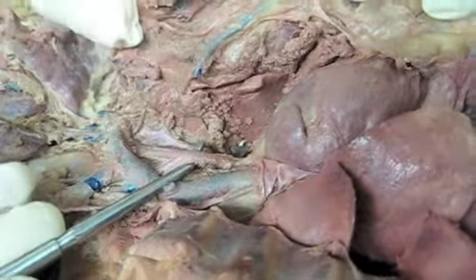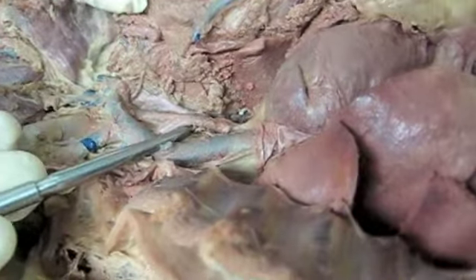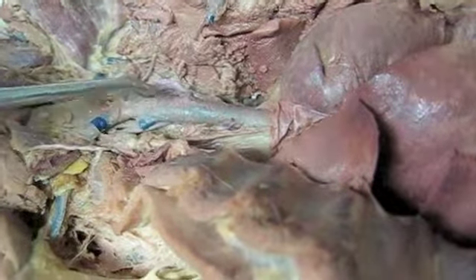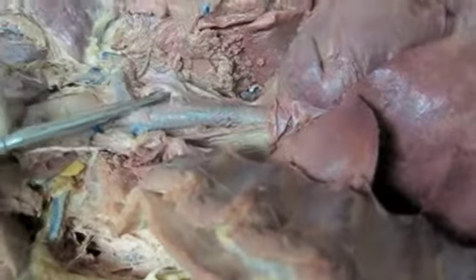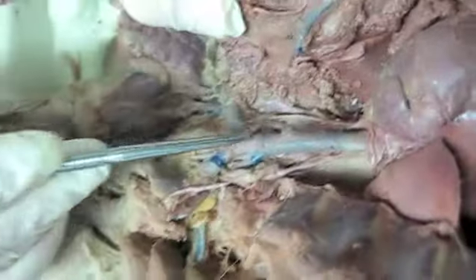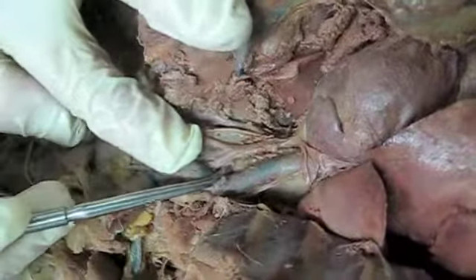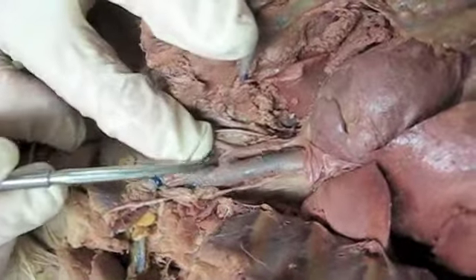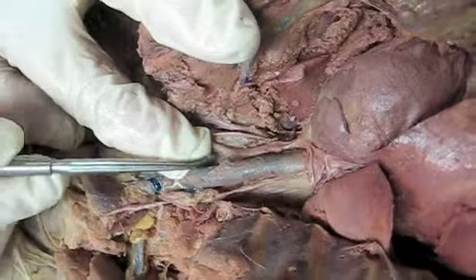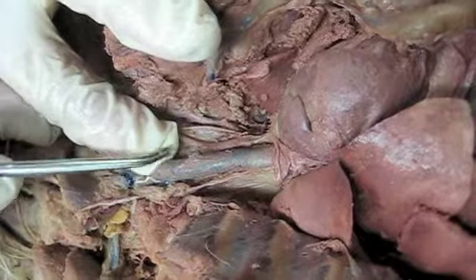In terms of the arteries, the big one that's coming off the arch of the aorta is the brachiocephalic artery. It divides into three branches, and Gabby's is a little bit different than some of the others, but that first branch here is going to be the left common carotid. It's going to go up the left side of the neck. And if you lift up the anterior vena cava, you can see a big part right here. Usually it branches so you can see all three together here, but Gabby's is a little bit different.